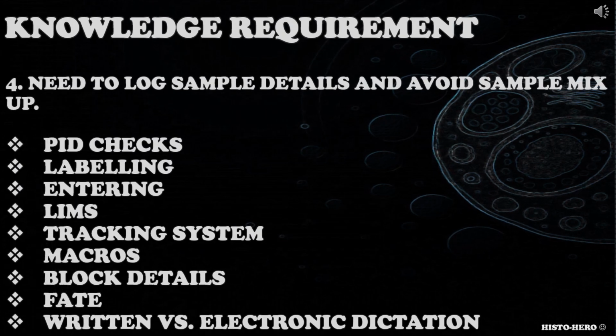The fourth knowledge requirement is for you to understand the need to log sample details and avoid sample mix-up. How do you log sample details in your laboratory? Why is it important? What would happen if there was a sample mix-up? How would you deal with a mix-up of specimens? Consider PID checks during specimen reception, labelling of samples, LIMS systems used in your lab, tracking systems used in your lab such as Vantage, macroscopic description of samples, details of blocks taken, fate of the sample after dissection and so on.